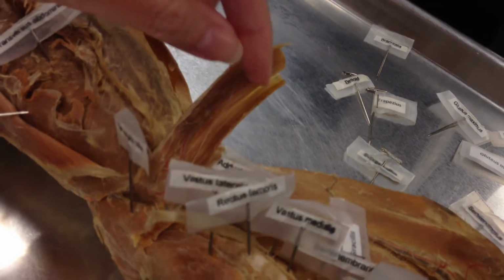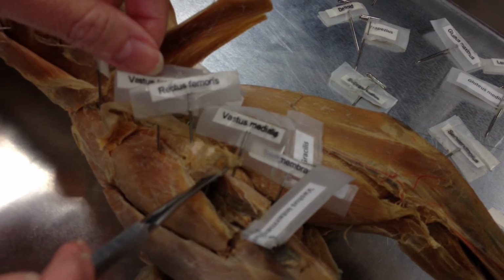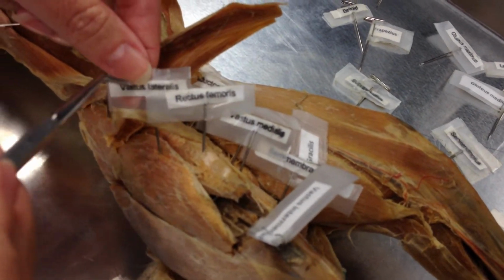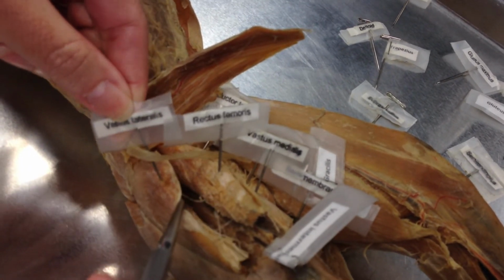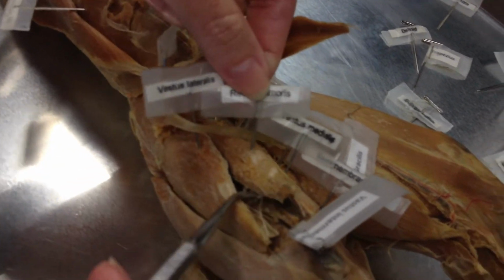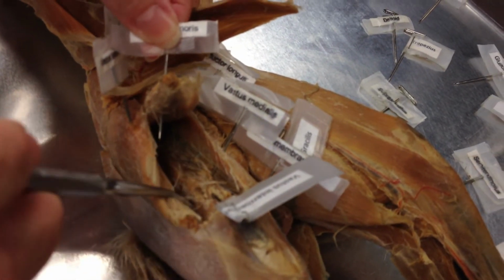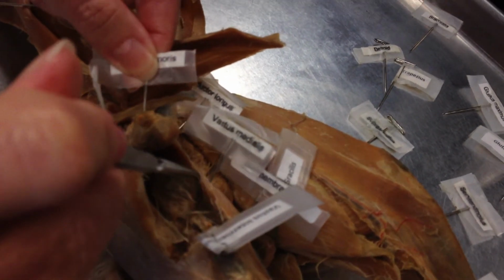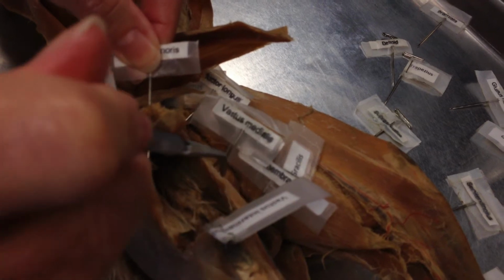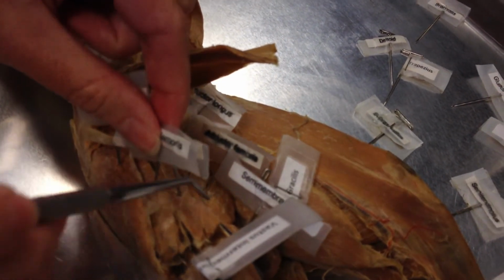And underneath we find the quadriceps group. Rectus femoris, our hot dog in the bun. The bun is made of 3 parts, each called vastus. On the lateral side, vastus lateralis. Underneath, intermedius. Vastus intermedius makes up the bottom of the bun, and on the medial side is vastus medialis. That's a quadriceps group, the hot dog in the bun muscles.